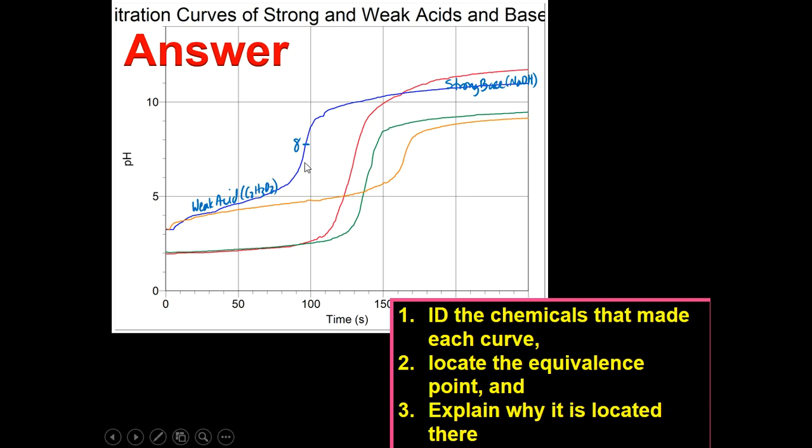And that means that when they reach their equivalence point, it's actually slightly basic because you've got not only this strong base, which is the sodium hydroxide, you have the conjugate base that the acid becomes, so he becomes the new receiver. So with extra receivers in there, it pushes the equivalence point up to a little bit of basic land. There's less protons around because they've all been gobbled up, right? If I look at the next one, you can see that right here, this orange one, hey, well, that's the same pH, so you can tell that's a weak acid, but this time I combine it with a weak base.